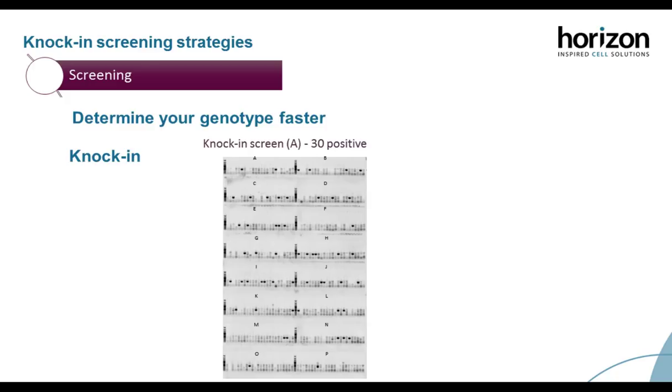So now that we've screened our cells, we're going to go on to the validation. And there is really no shortcut to the validation. You just have to do the validation. It's very time consuming, but it is very important to understand what you'll be working with.